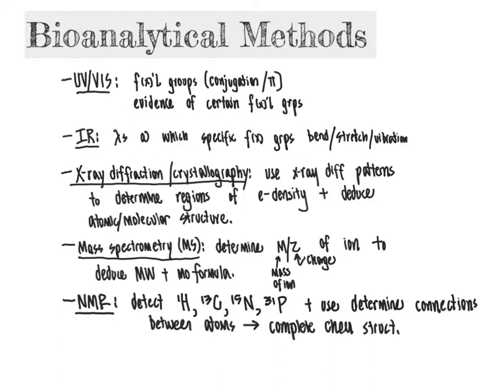So we will get into the details of interpreting NMR data, and by the end of this unit, you should have a much better understanding of applying both 2D NMR and 1D NMR together to come up with the chemical structures of relatively complex organic molecules, and also synergizing that information from NMR with these other tools and techniques that we have looked at. So that's where we're headed in this unit.